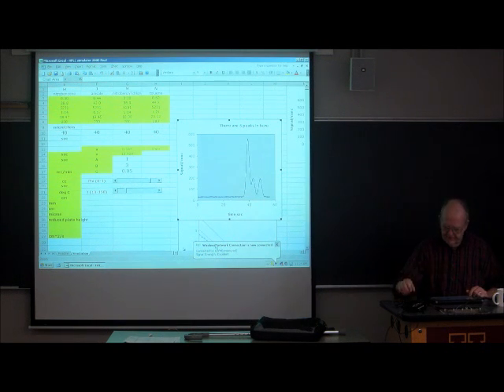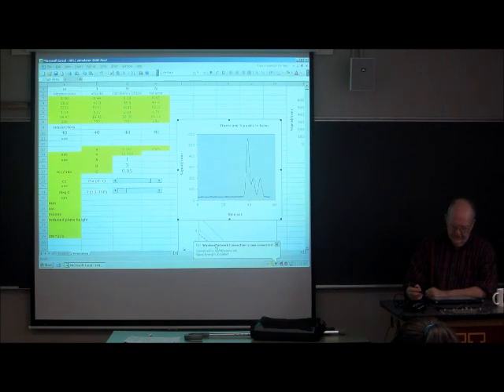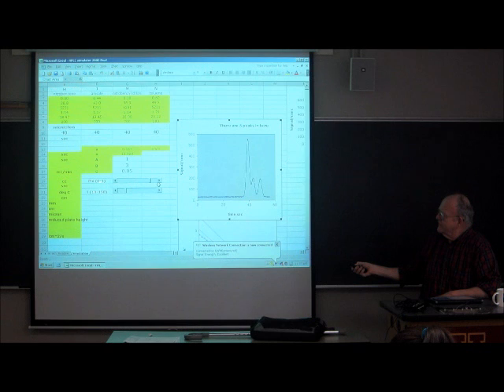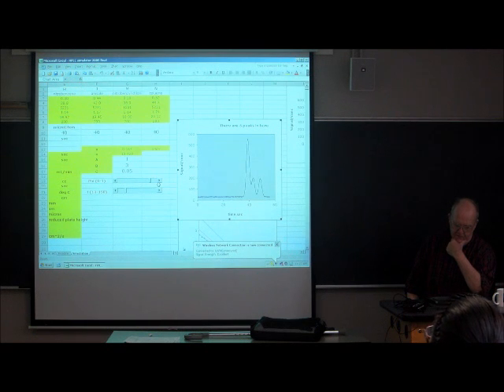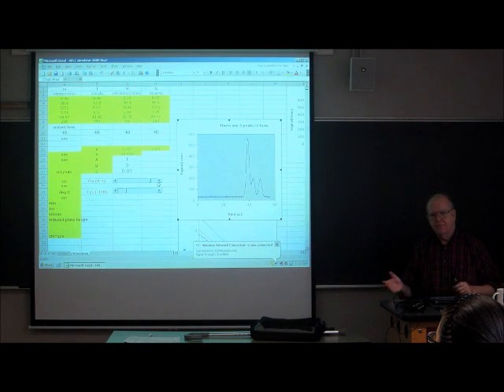You can adjust the chromatography and the relative retentions in liquid chromatography in general in 2 ways. You can change the mobile phase composition, which is what this adjustment is, and this is volume fraction of organic modifier, and we're doing reverse phase chromatography. So when you increase the volume fraction of the organic component of the mobile phase, the other component is water, you make the mobile phase stronger and stronger until it's pure organic. And that corresponds to a volume fraction of 1.